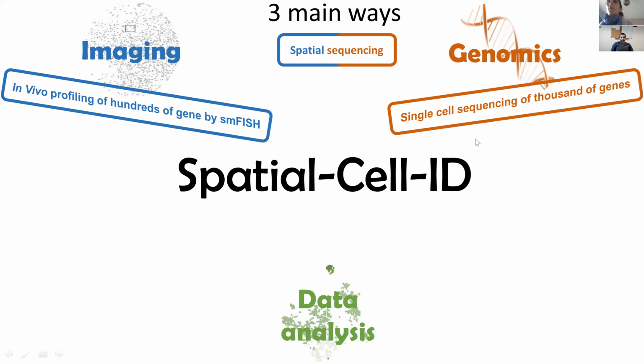Genomics here, where you can profile RNAs from thousands to millions of cells at a time and sequence them in parallel. And then there is another method that is kind of in between imaging and genomics and uses both techniques, and this is called spatial sequencing, which we will explain later. And then, of course, all of this will be combined with the appropriate data analysis pipelines.